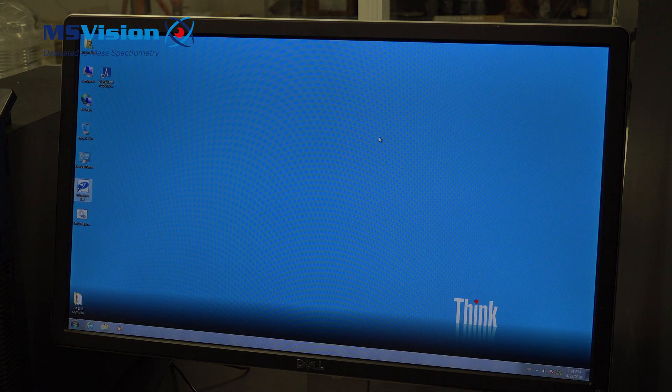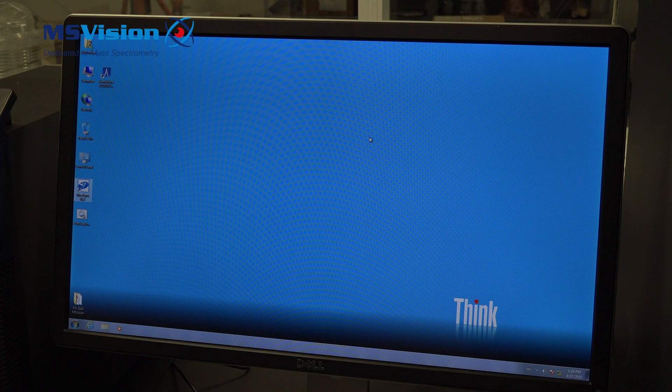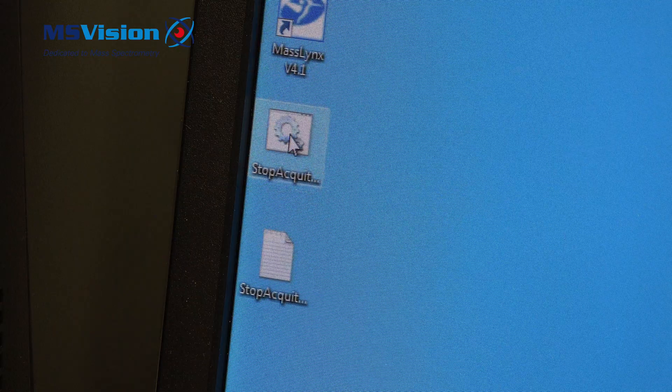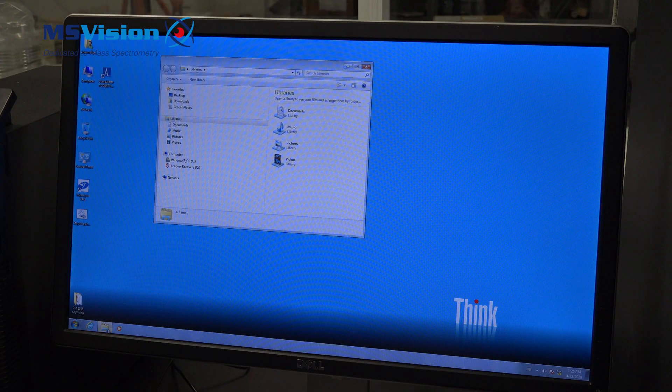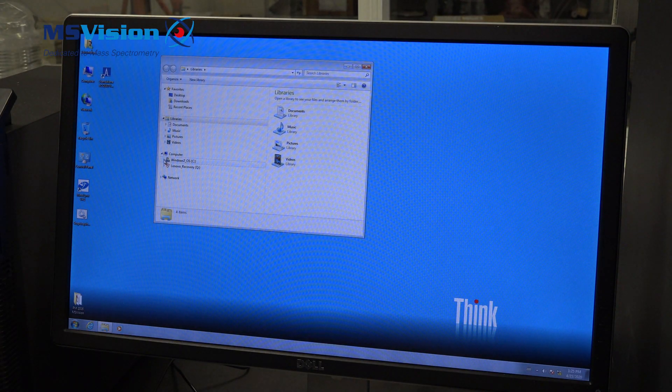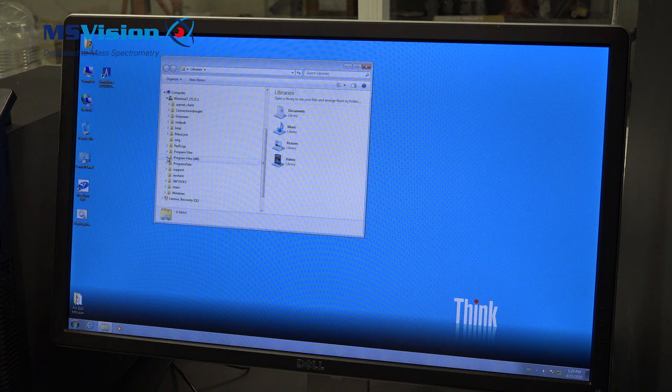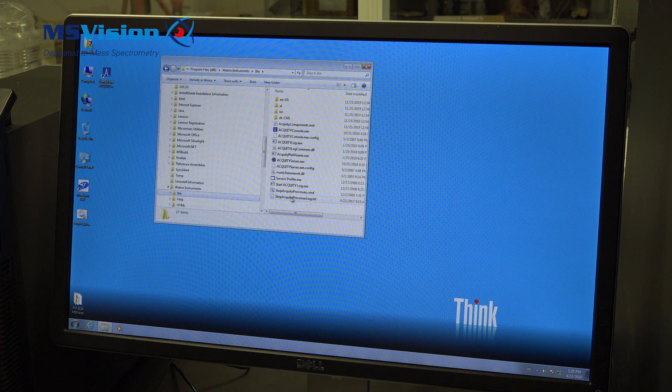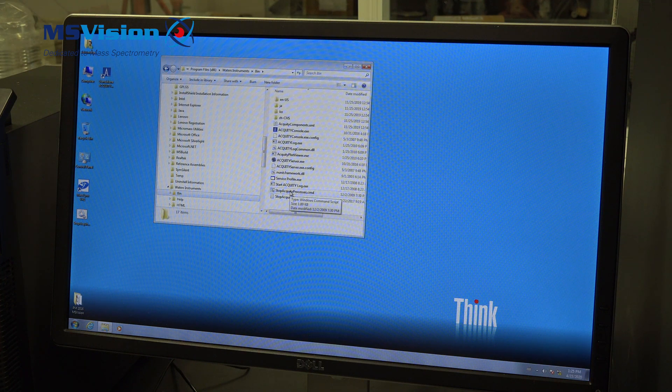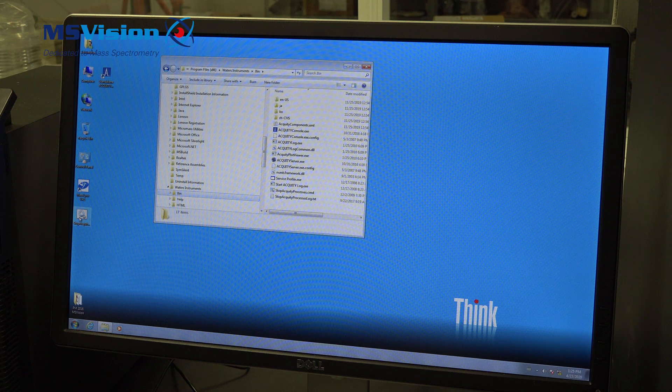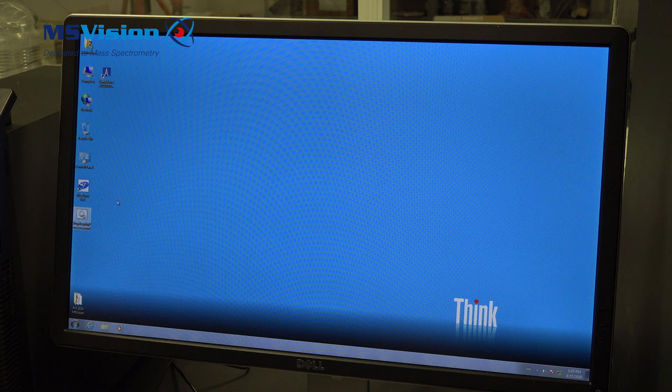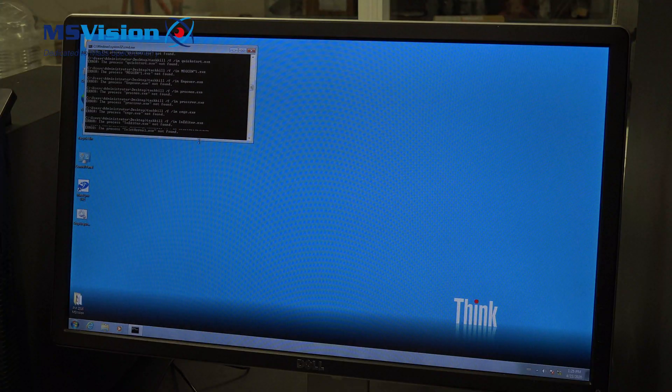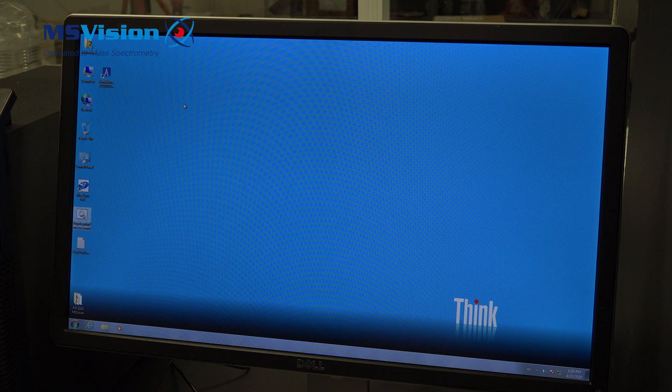Of the acuity MS systems, there is a shortcut which is called Stop Acuity Processes. We find this in Windows in the PC in the Program Files x86 folder, and if you go down to Waters Instruments to the bin, it's always there. It's good to make a direct shortcut on the desktop which is a lot easier. If you double click it, you can see here a window popping up and closing all the instrument files which are active.